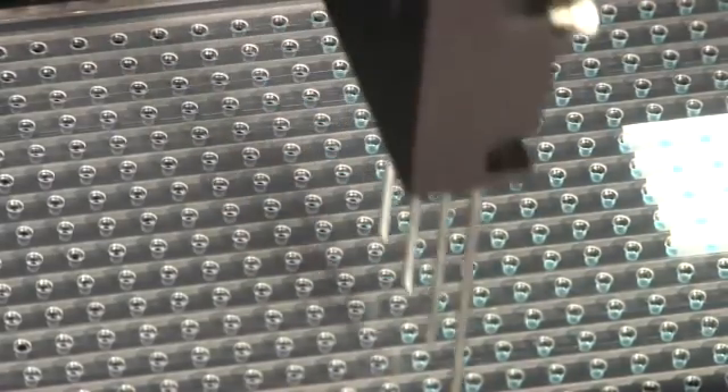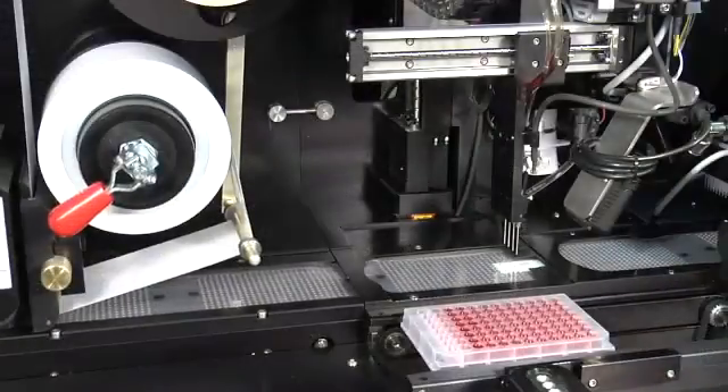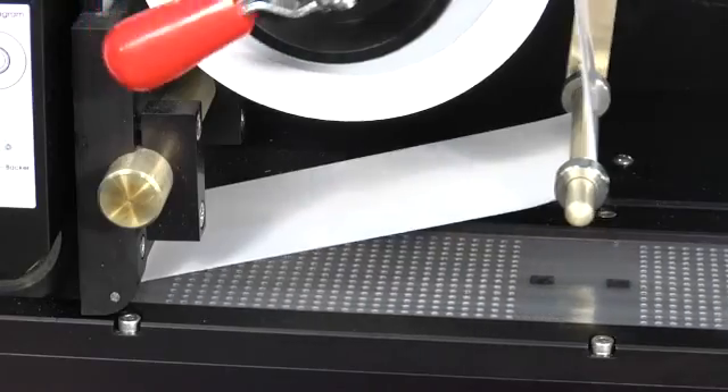You will benefit from a flexible system that supports many different chemistries. Each array is then automatically sealed, eliminating manual handling and robotics.